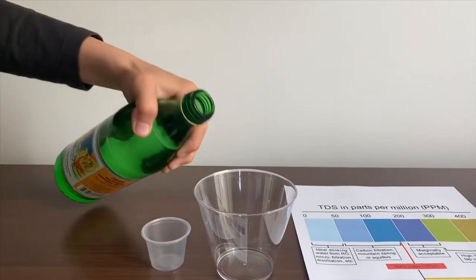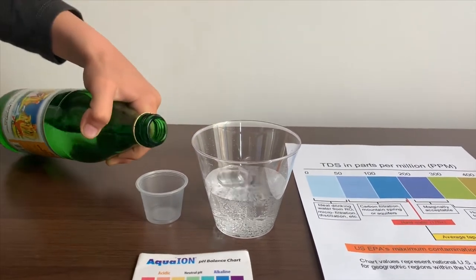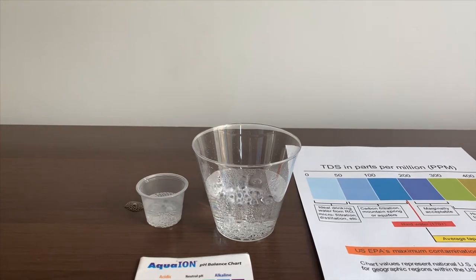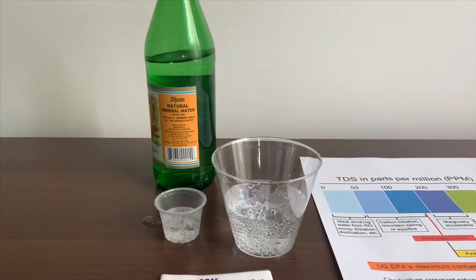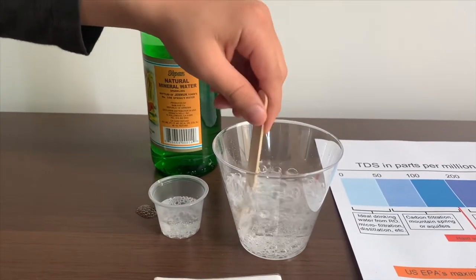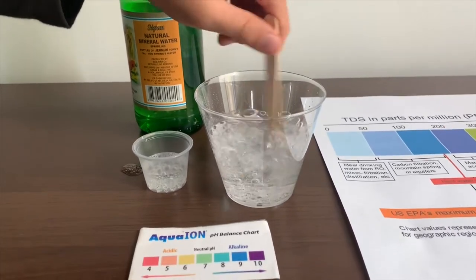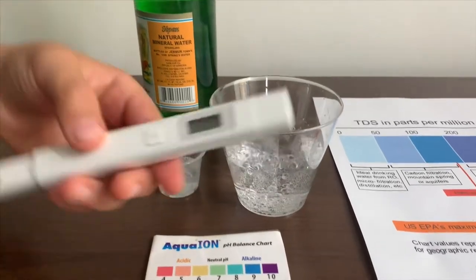Let's pour some water in. First we're going to test the TDS levels. Let's settle the levels so we'll get a better result. Now let's test the TDS levels.